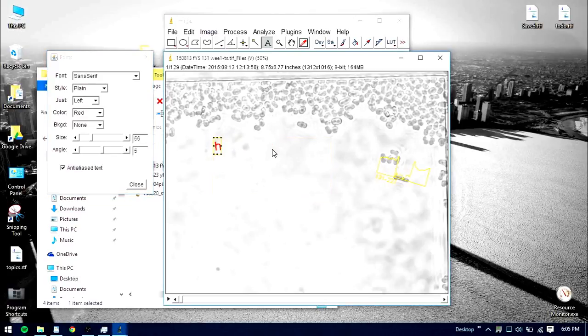And if you push Control B, or on a Mac, I'm sure that's Command B, it'll stick in place. And the reason why you can have this red annotation on top of this 8-bit image, even though 8-bit technically shouldn't support color, is because this isn't actually putting it on top of the image. It's not changing the underlying image information. All it's doing is overlaying its own personal reminder on top of it, if that makes sense.